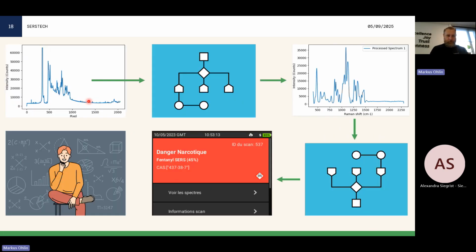And in this case, the fluorescence is, again, the same sloping signal, but here afterwards, at a certain point, it's cut off and filtered away, because you have to put in what is called a notch filter that cuts light below a certain wavelength in order to not get too much of this Rayleigh scattering. So both Rayleigh scattering and fluorescence are filtered away. I mean, in the hardware, not by any kind of algorithm or software feature, but it's physically filtered away.